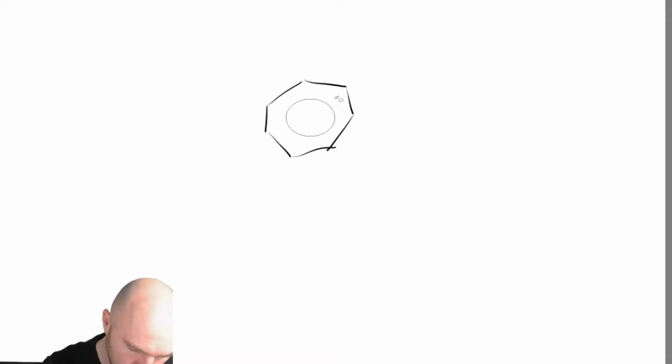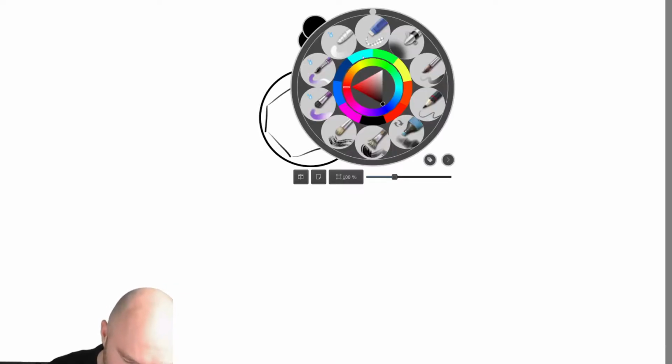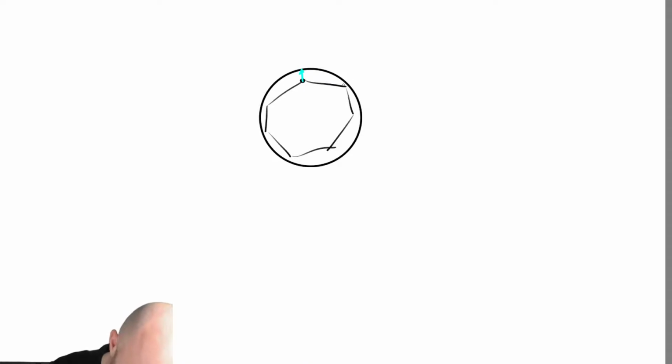So essentially, if you look at these triangles here, I'll just make a very, very simple grain boundary, and we'll have something. And this is our hull. What it does is essentially it goes and looks up what the line elements are here. The line elements are here, and then it will create a vector that goes straight out from the line elements. So it will find out which line elements constitute the boundary, and then create vectors that are going out in this direction.